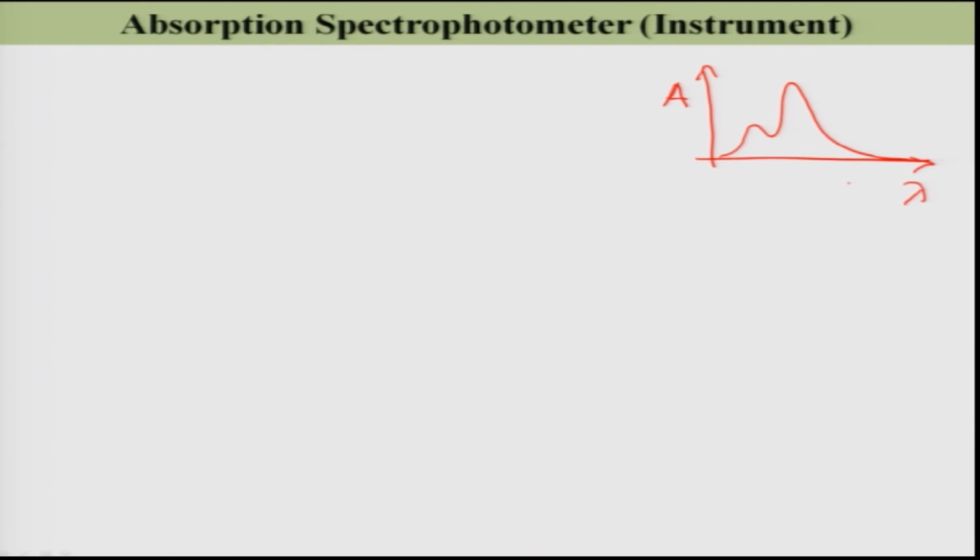So, basically, I have this I0, and I have my sample over here. The light after passing through the sample becomes I, right. Do not forget that this is wavelength dependent, that means I have to somehow scan the wavelength. So, this is a function of wavelength, and this is also a function of wavelength. So, I have to measure this I0 and I. How am I going to measure this I0 and I? So, first let me discuss the single beam spectrophotometer.